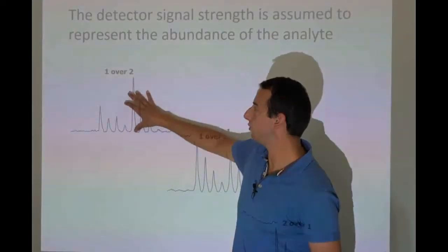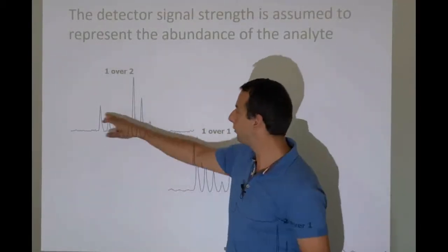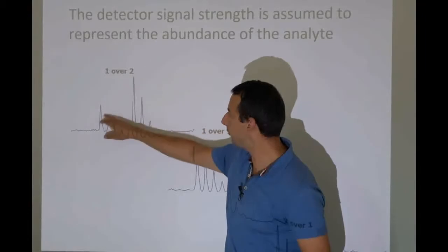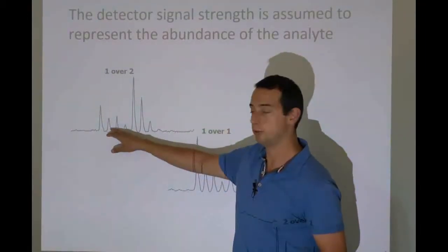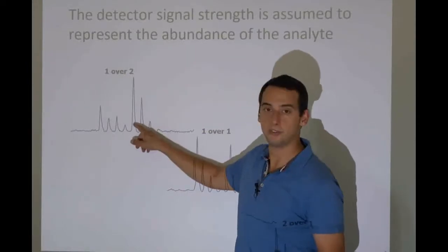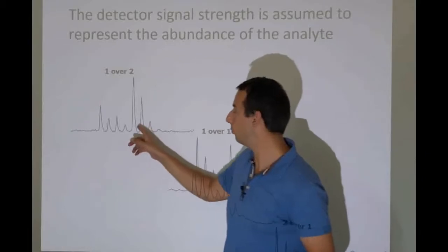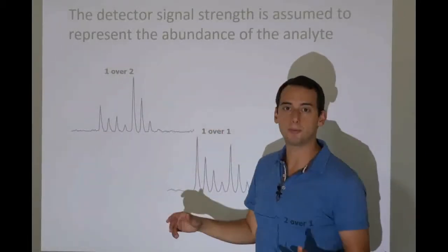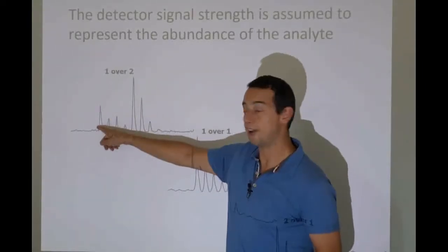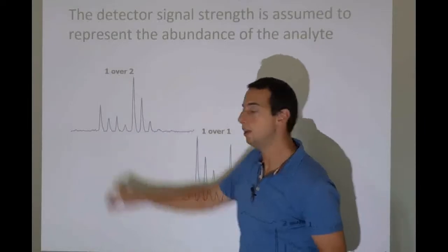And suppose we know just how much of this compound we spiked into the sample. We can now say this one is roughly half of that in intensity. So, since they are the same molecule, the only difference is that this one contains a few extra neutrons, which should not change the physical chemical properties apart from the weight. We can say if this is, say, 10 nanograms per milliliter, then this one will be 5 nanograms per milliliter. You see, because it's half the signal.